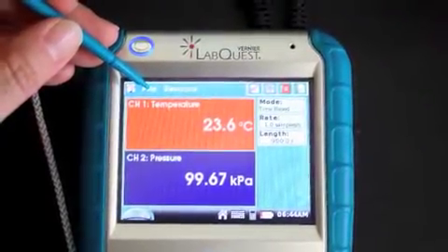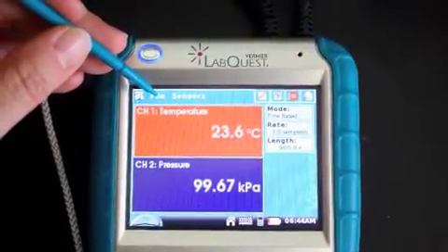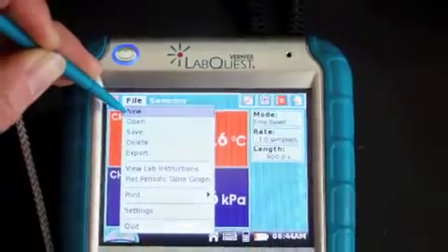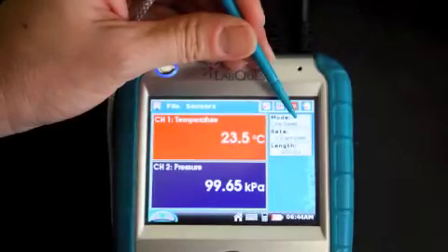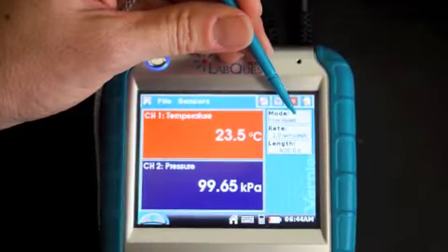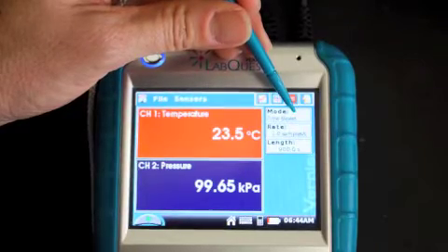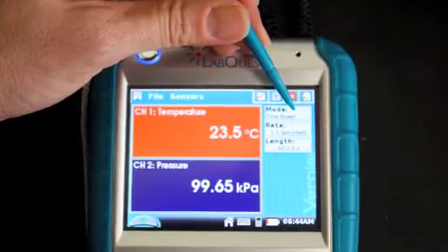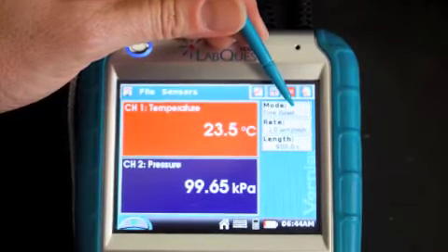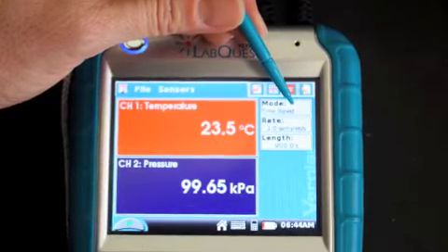Set up the LabQuest to collect a new round of data by tapping the File menu and pulling down to New. Now we want to set the mode in which we're going to collect our data. We could do this with our manual start and stop buttons, but we're going to make it easier by setting the length of time and the number of samples so that the LabQuest will do most of the work for us. First of all, tap the Mode menu in the upper right-hand corner.